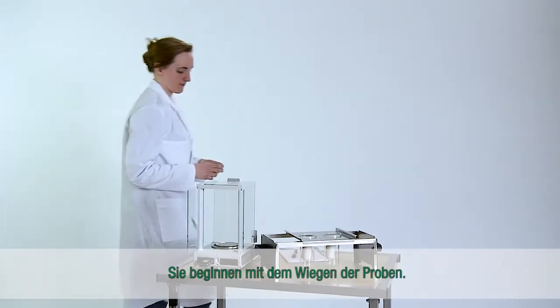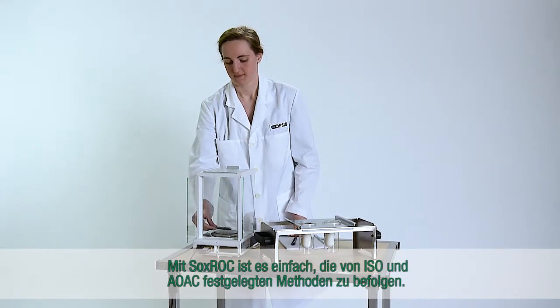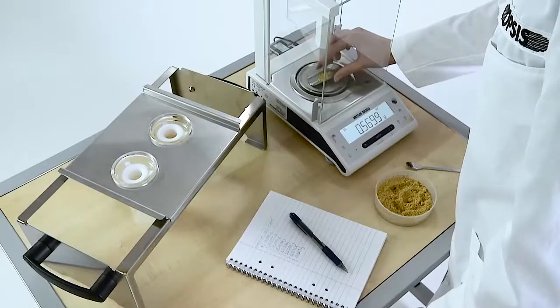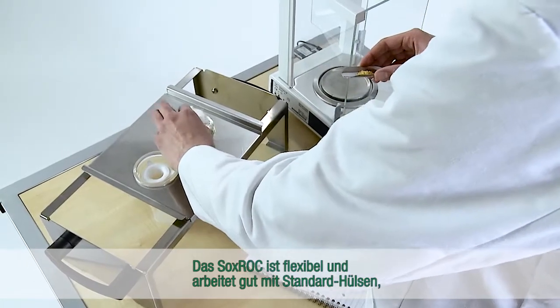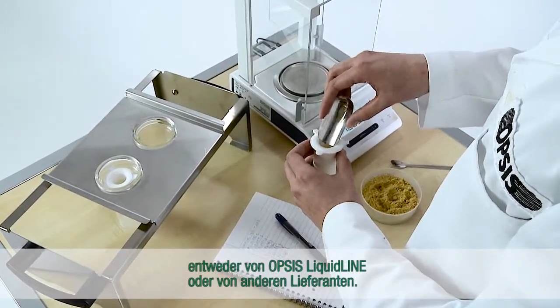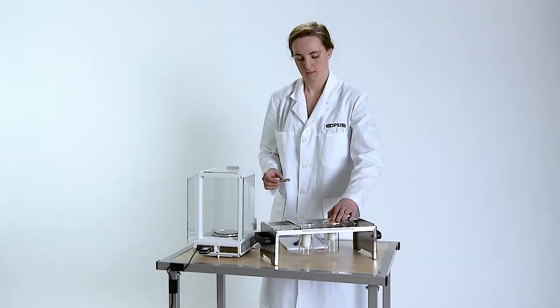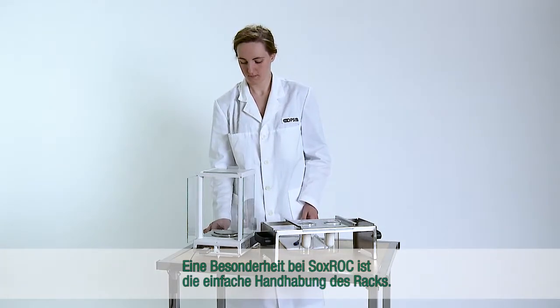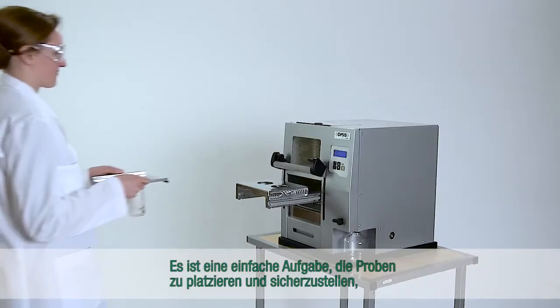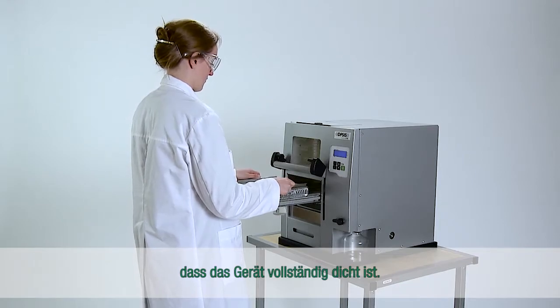You start by weighing the samples. With Soxrock, it is easy to follow the methods set by ISO and AOAC. The Soxrock is flexible and works well with standard thimbles, provided either from Opsys LiquidLine or from other suppliers. A unique feature of the Soxrock is the easy handling of the rack — it is a simple task to place the samples and make sure that the instrument is completely sealed.